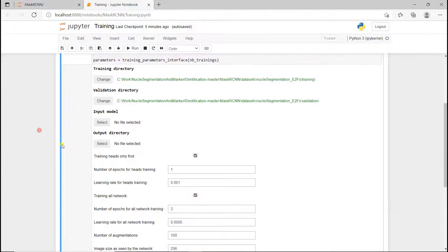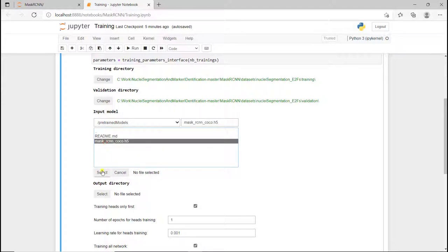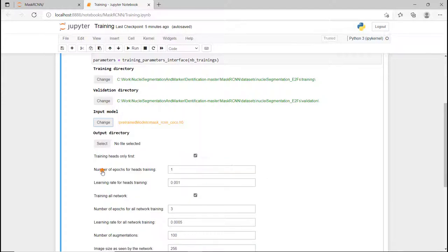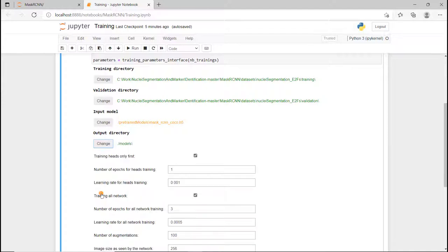Let's go back here, and now if I go to selecting pre-trained models, I have the Mask R-CNN that's been pre-trained with COCO. That's what I want to use. And then the output directory, which is going to be in models like this.